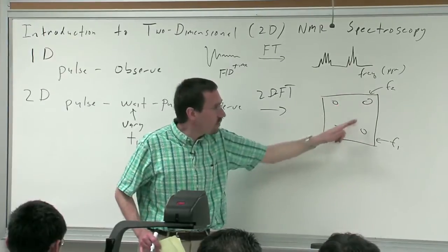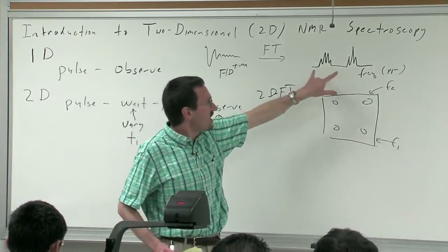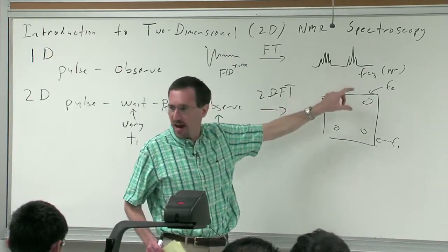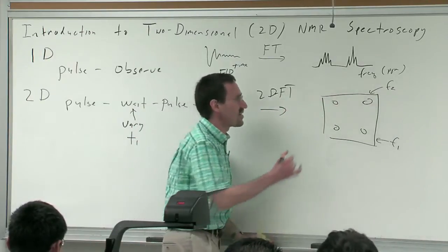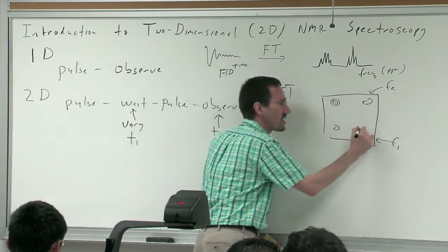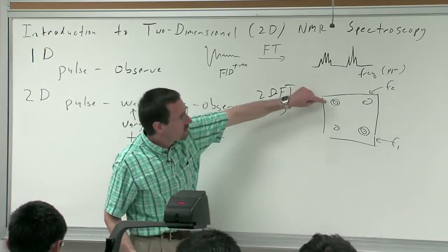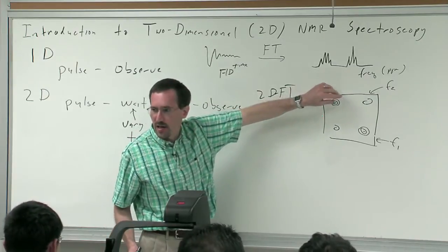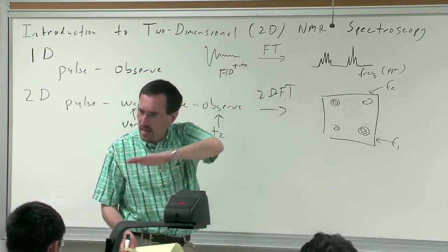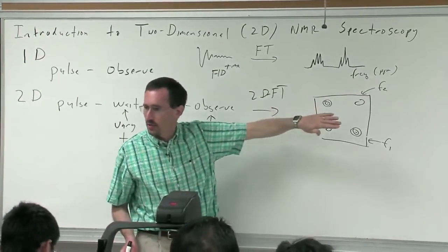It is, of course, plotted two-dimensionally, but just as this is actually a 2D graph, this is a 3D graph, if you will. Typically these days, the way we express it is as a topographical map, so you'll see a series of contours. It's just like a topographical map of the mountains: each contour represents a certain height.